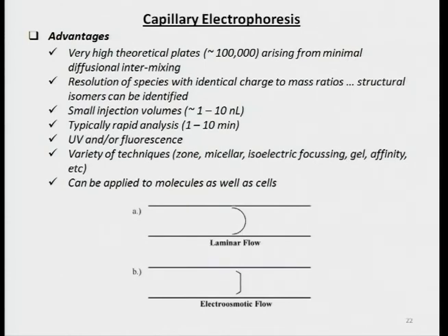This I already said. And then the advantages: there are really small injection volumes. You could be working with a 10 nanoliter sample. That's extremely useful. It also creates a problem because the sample has to be reasonably well defined. Then you can actually interpret it. In 1 microliter, you can do several dozen experiments, as simple as that.